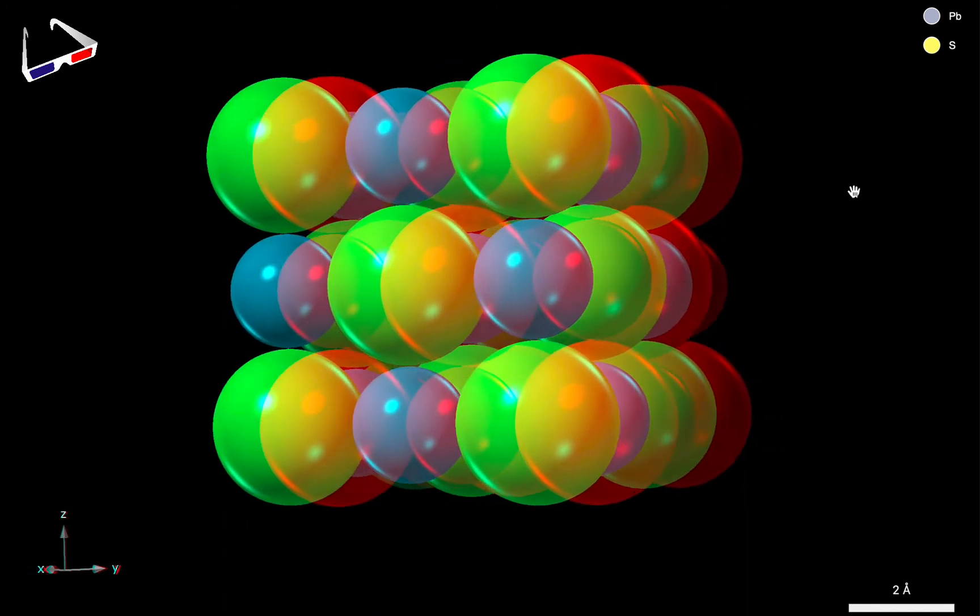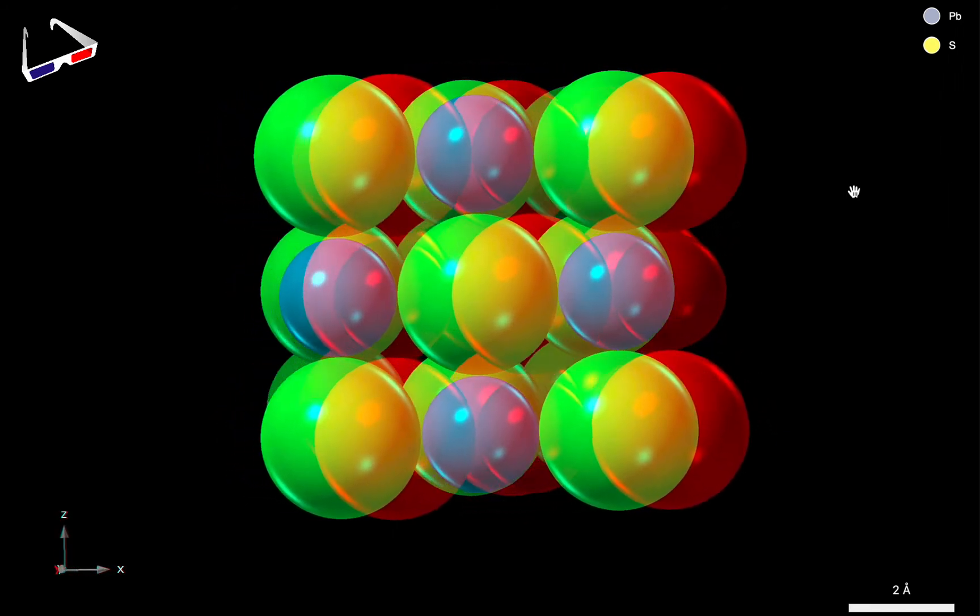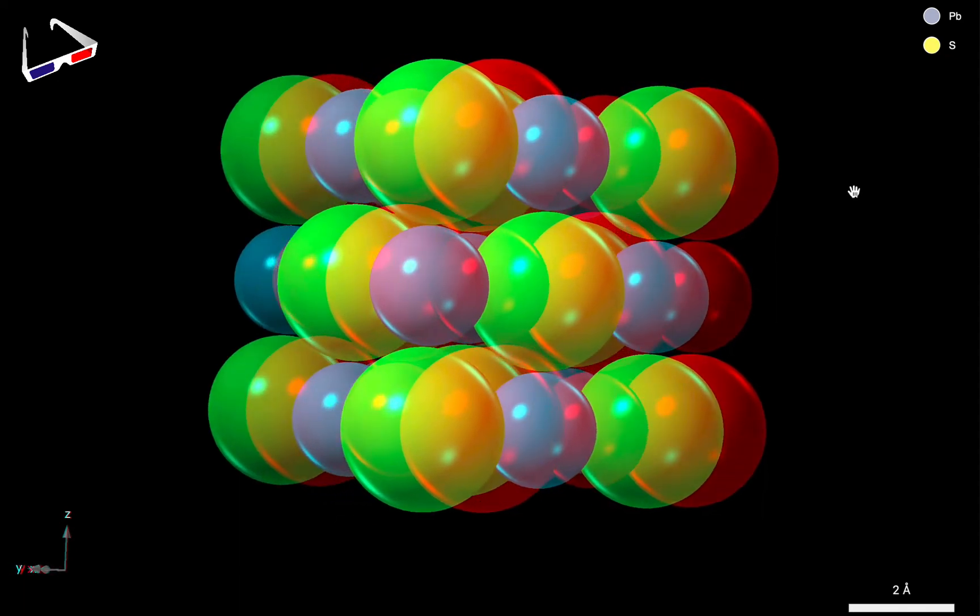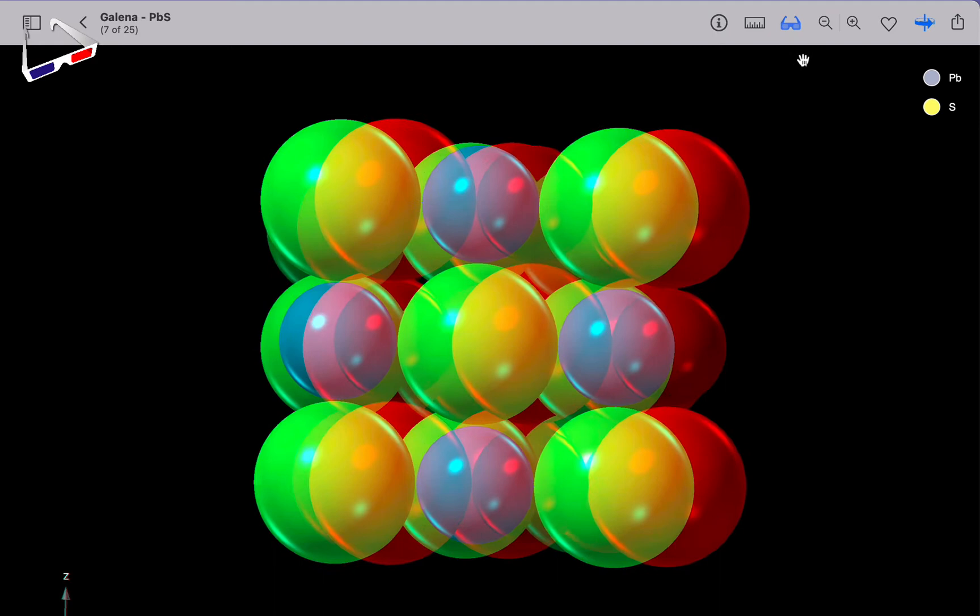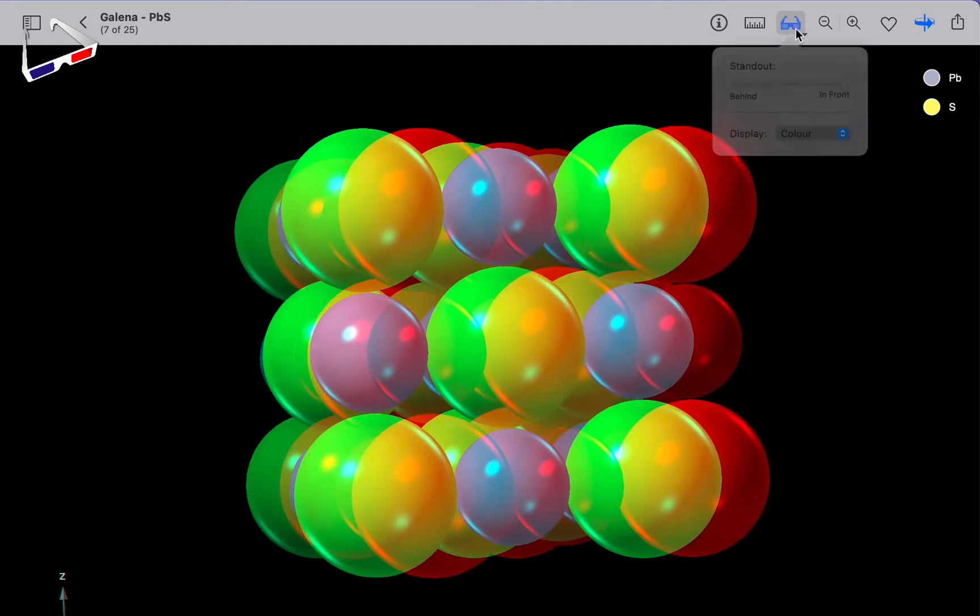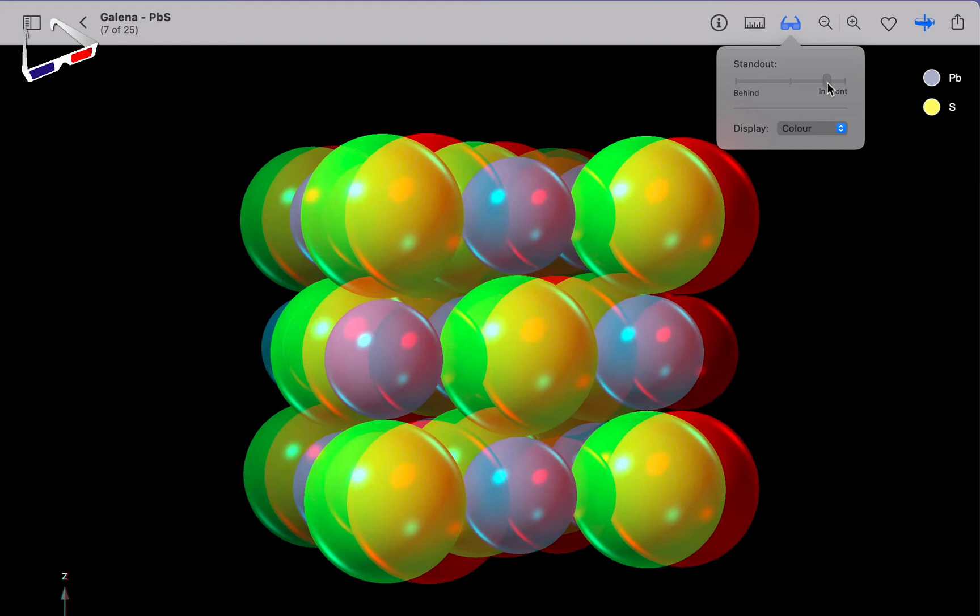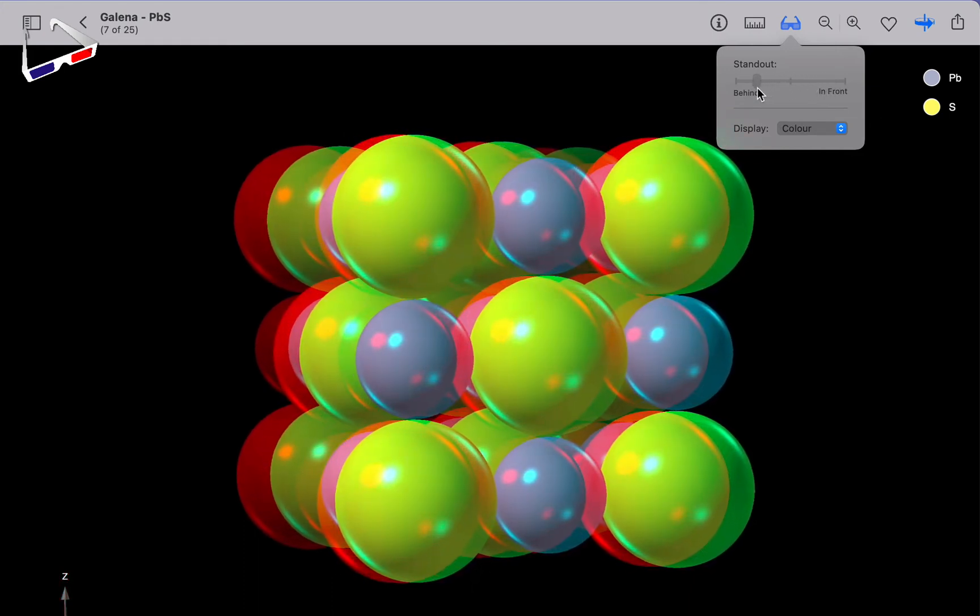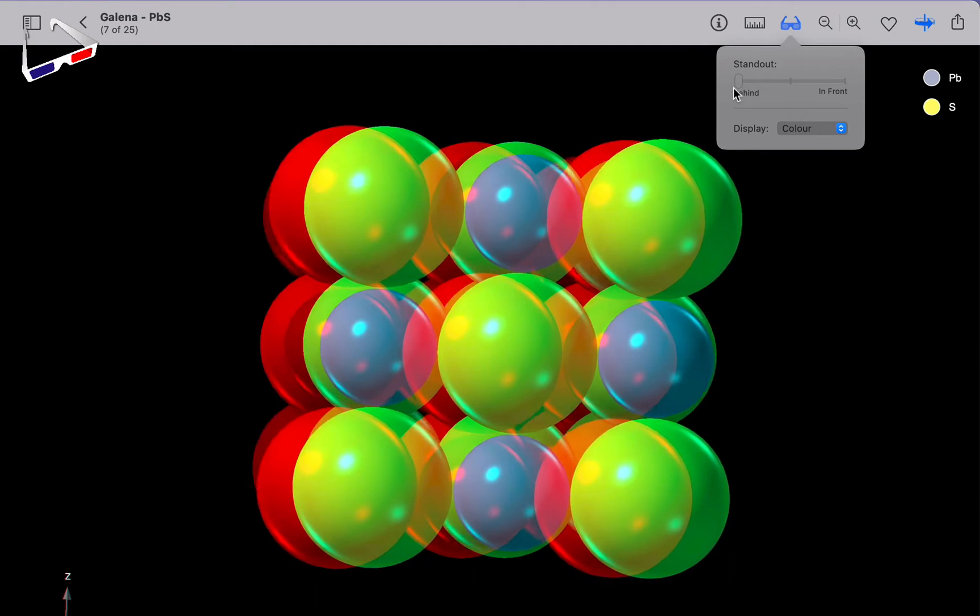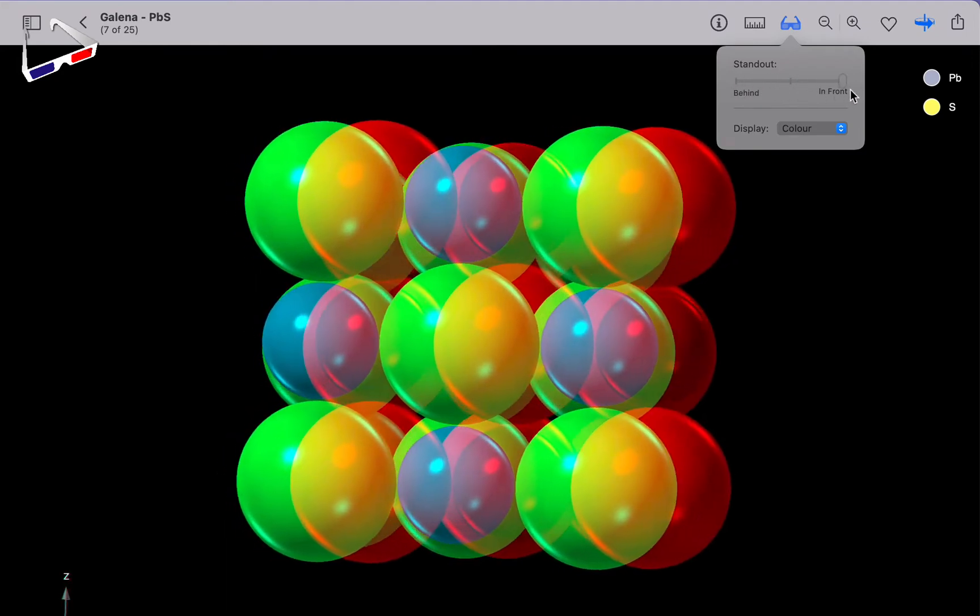Now let's talk about depth and what we call Stereo Standout. And this is a way in which you can make your models look even more impressive by making them appear to float outside the computer screen, over your keyboard or even over your desktop. And to do this we can use a little slider control to move the model from the front to the back. Now if you move the mouse pointer over this Stereo button, you might notice a little downward pointing arrow. And that indicates that if you click and hold, then you'll get a popover. And here's our standout slider. And if I click and drag, then you'll see that the colour tinted images shift. And if you're looking at this using red-blue glasses, your model would now appear to be behind the computer screen. This is actually quite a relaxed way of viewing, but it's not quite as impressive as making the model come completely out of the screen and float towards you.